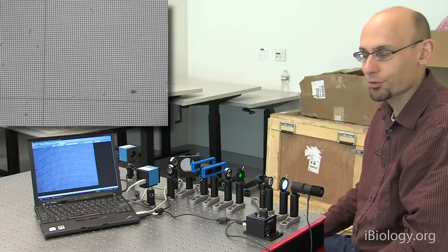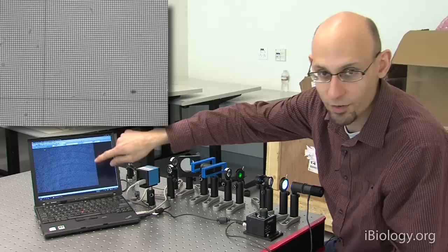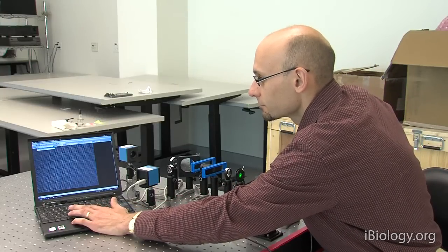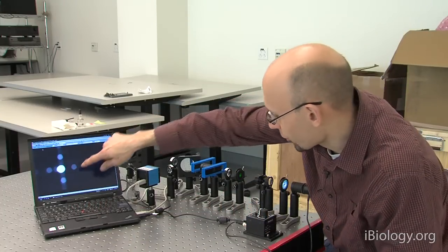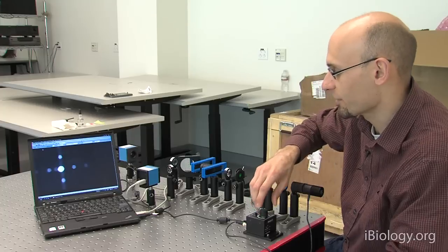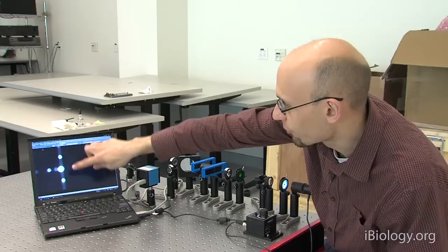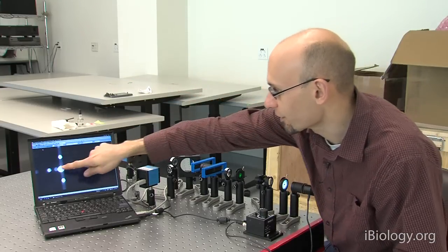And based on everything I've told you so far, we would expect that this should give rise to diffraction in both directions, because it has both horizontal lines and vertical lines. So again, we'll switch to the back focal plane camera. And indeed, that's what we see. So we've got our zero-order light here. This central spot is the undiffracted light making it through our system, which hasn't interacted with the grating. And then we see these horizontal and vertical spots diffracted by the grating. And again, this vertical stripe here is a camera artifact from this bright central blob. And this guy over here is a back reflection.